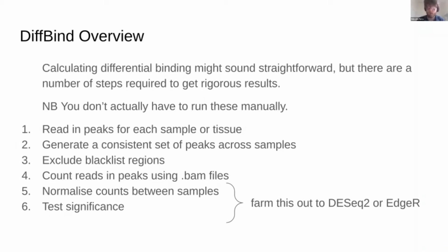So what I think you've done with Ilias is you've called peaks using several replicates of one tissue, right? Yeah, so that makes perfect sense, and that's a really good way to generate robust peaks. But we're actually going to unify those peaks between sperm and oocyte in this step, because it doesn't make sense to call peaks using this kind of replicate-based calling when they're different samples, because you'd expect them to be different.